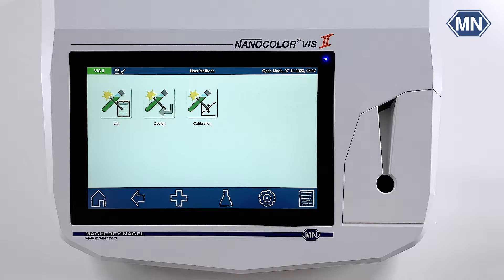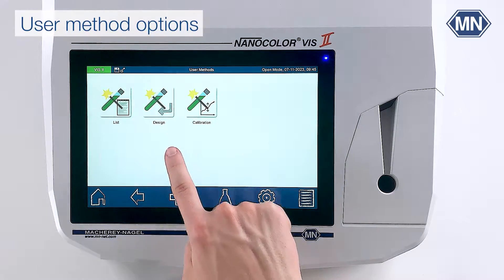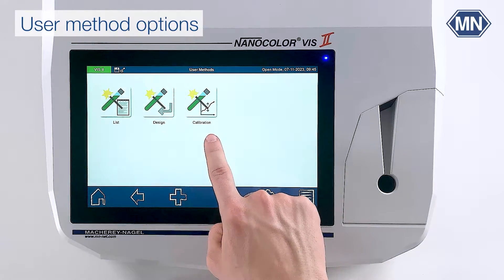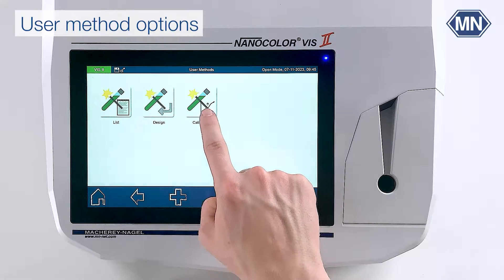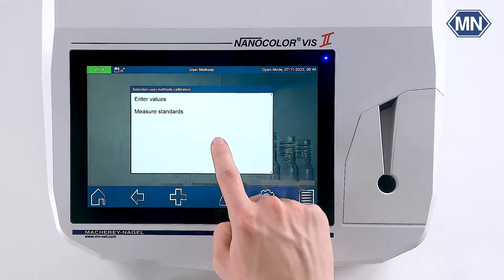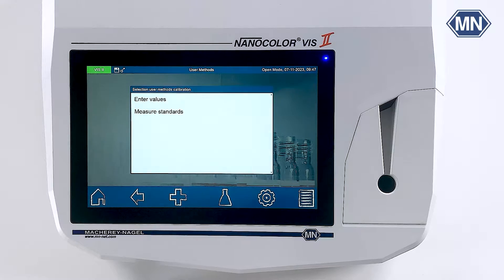Here two different options are available. You can either create a method based on existing experimental data by using design, or perform a live calibration as we will do in this video. If you already have concentration-absorbance pairs in hand, use the enter values option to create a user method.